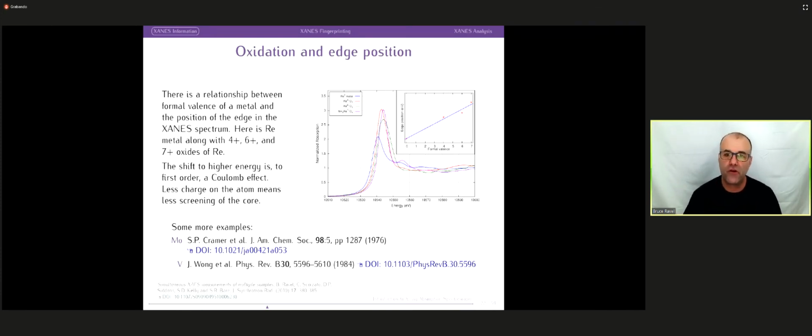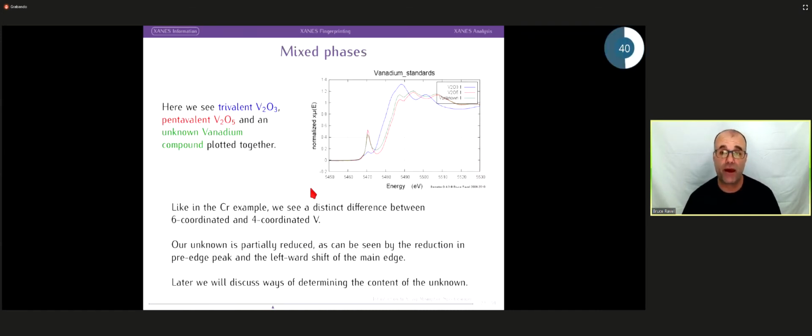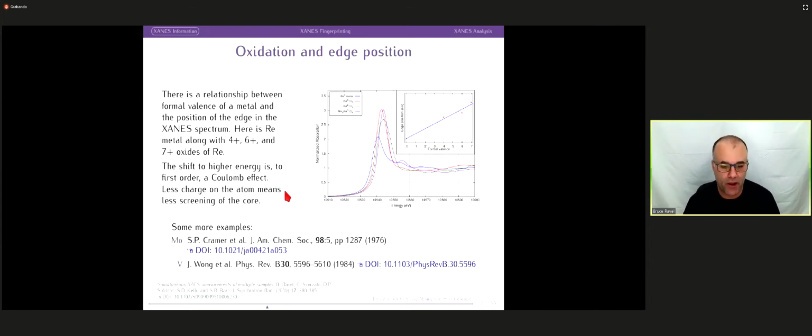These are things that don't require very sophisticated analysis. These last few slides have all been things that you can just tell at a glance from a XANES spectrum. From here, we're going to start to get a little bit deeper into what the XANES does.